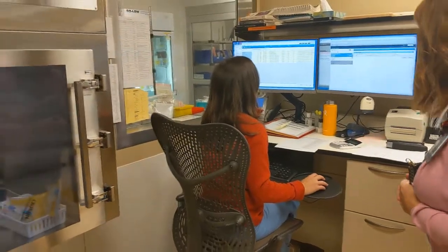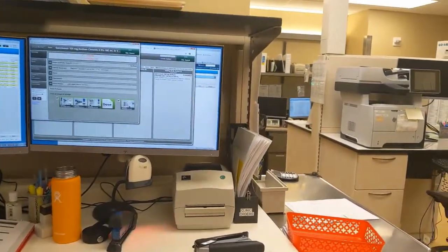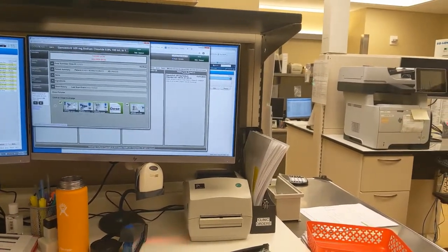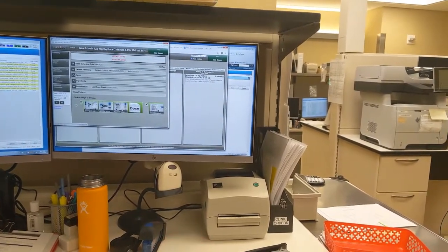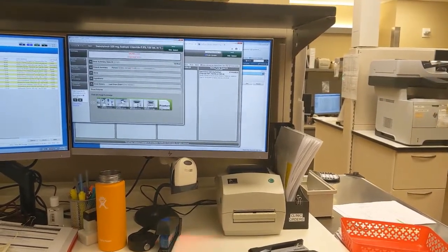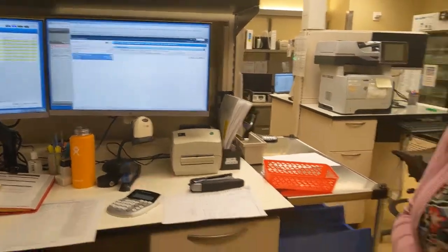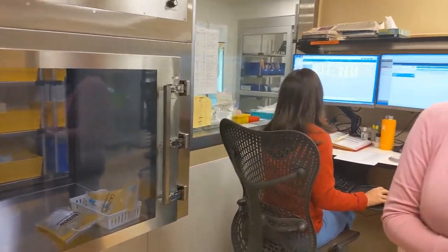If you look over here at our pharmacist, she's able to see, if you could pull up a picture please, what medications the technician has prepared by utilizing camera technology. So utilizing the photographs that the technician is taking through the drug preparation process, she's able to see exactly what was pulled up, from what vial, what the dating of that vial was, and what the technician then added to that final product. So we have a very good record of what is happening in real time through the admixture process. Once it's prepared, then it is set here in the pass-through for dispensing to our patient care areas.